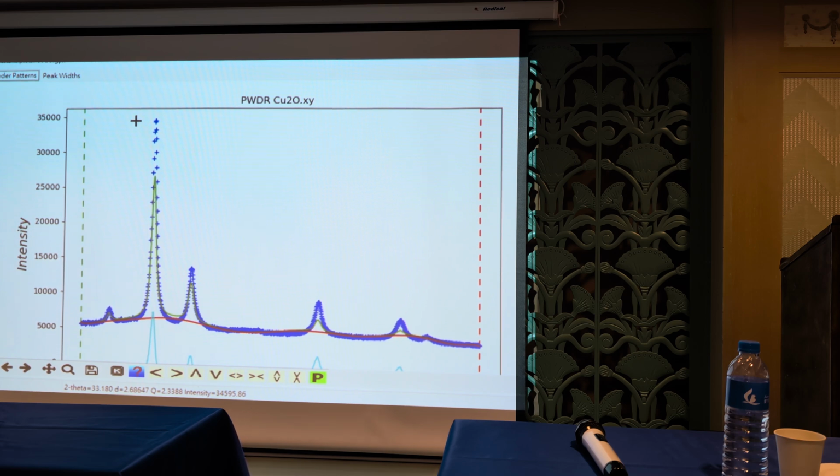For the X-ray, we will get the electron density map. For the neutron, actually we will get the diffraction density from the nuclei. Okay, so that's a different meaning. So how to plot the? Okay, wait a minute. I need to restore the.